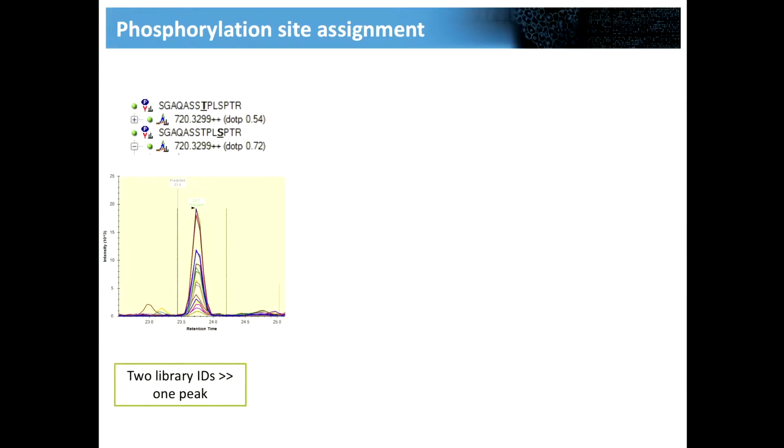One, two phosphorylated peptides with a different site are coeluting, and that's why we get one peak. Or there is one phosphorylation, only one correct site assignment, and the other is a false site assignment from our library. How would we check that? So I didn't hear. Unique transitions, correct. So what, for example, would be a unique transition that would distinguish these two?